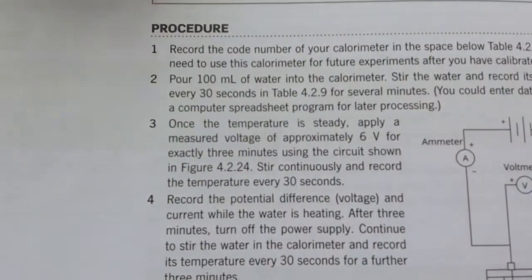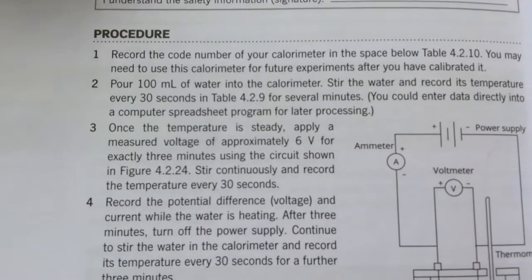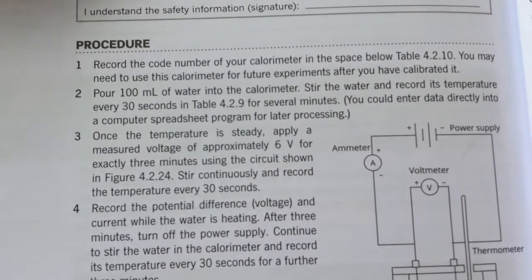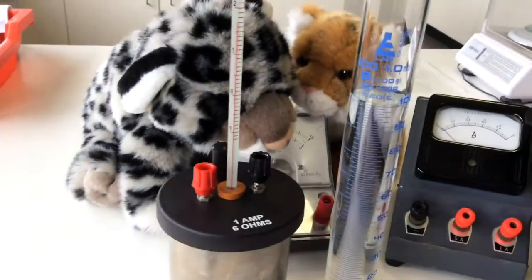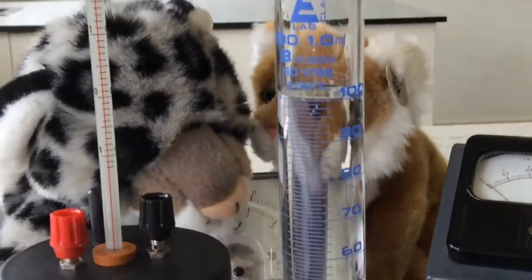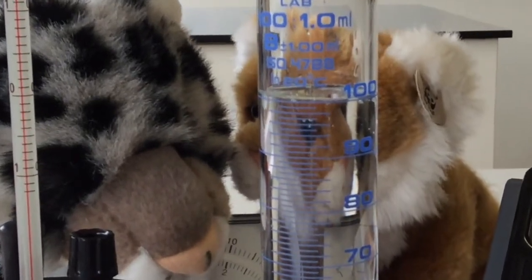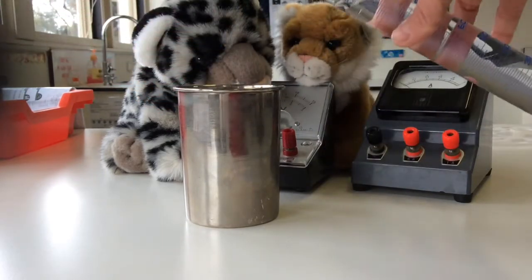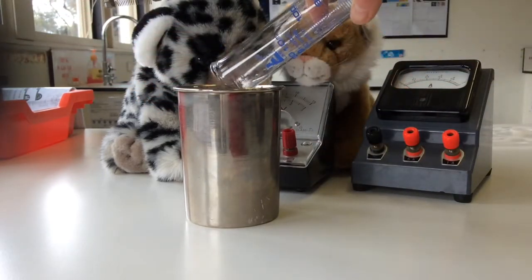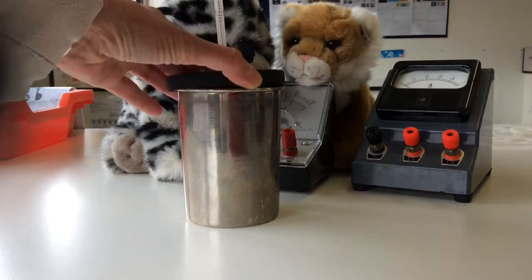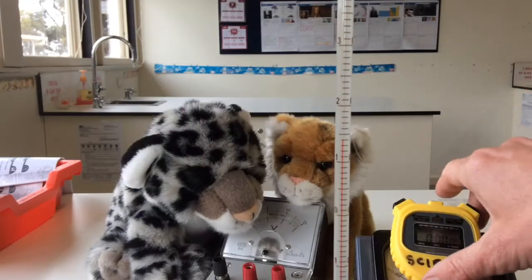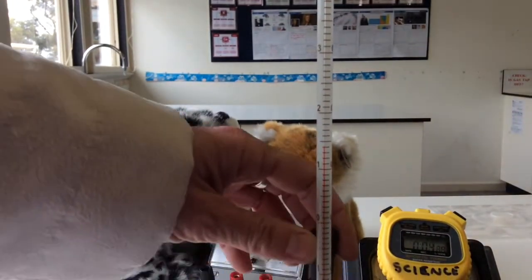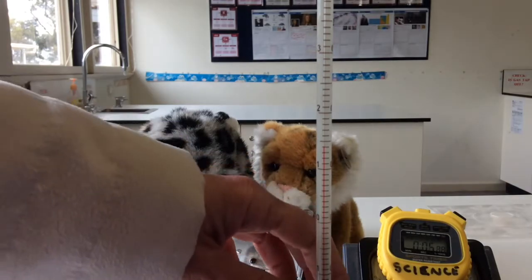And then it says pour 100 ml of water, stir the water, and record every 30 seconds. And basically, that's until you've got a constant temperature. So I've measured out the 100 ml. Okay, I've just added the water.